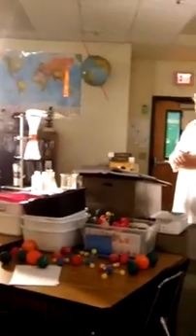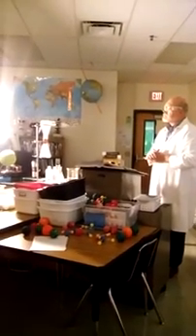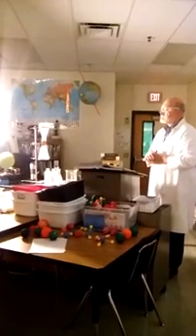Now the space shuttle in the video you saw uses thousands and thousands of gallons of liquid hydrogen. Okay? Many, many times much more than what I've got here in this flask. I'm going to give it just another minute here.